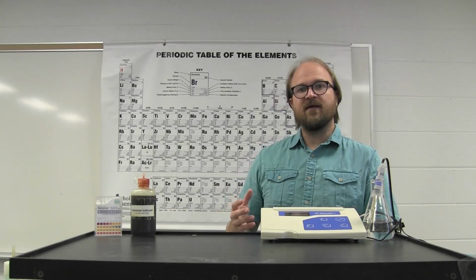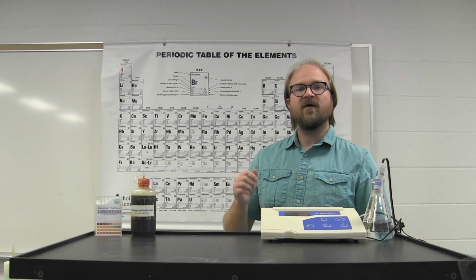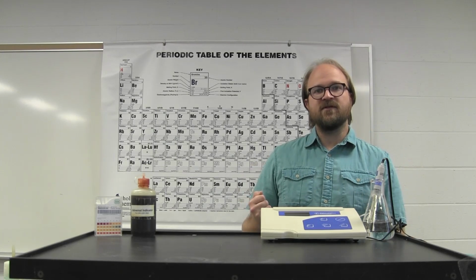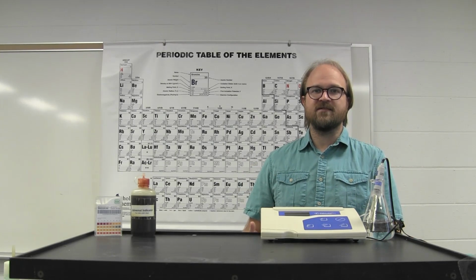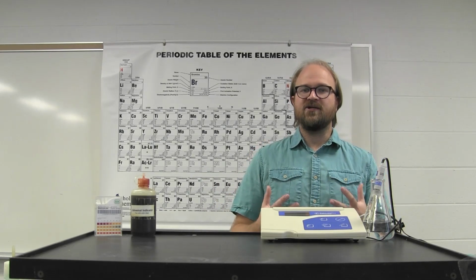And buffers are a mixture or a blend of an acid and a base that are in equilibrium with each other, where they maintain a constant or relatively constant pH. Because of the chemistry and because of the equilibrium between the acid and the base, a buffer solution is resistant to changes in that pH. If you were to add a little bit of acid or a little bit of base, the pH itself maintains a relatively constant value because of the equilibrium chemistry.